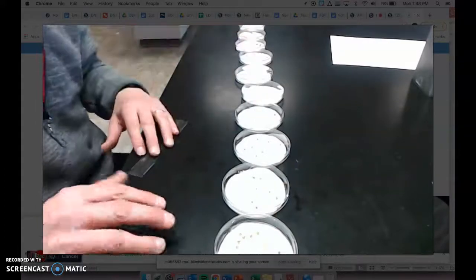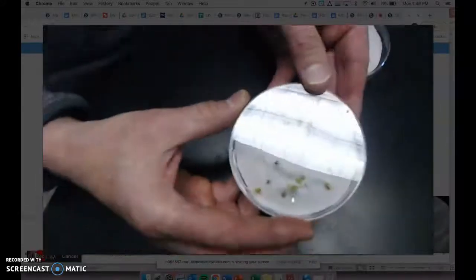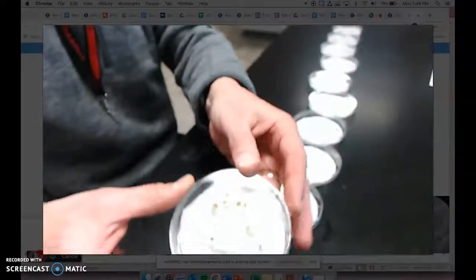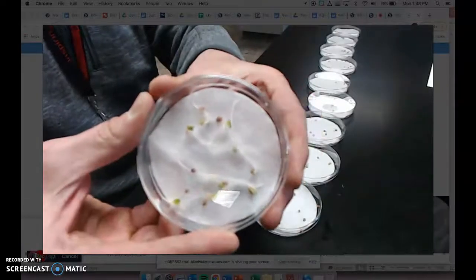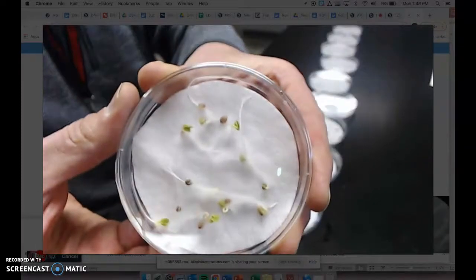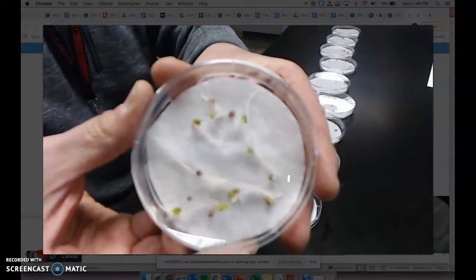Here is our LD50 spread, I guess. And I'm just going to show you this one down here. Here, let's try and bring it up like that. There we go. Okay, there's our control. And you can clearly see the radishes, all 10 of them have sprouted, and they are growing.